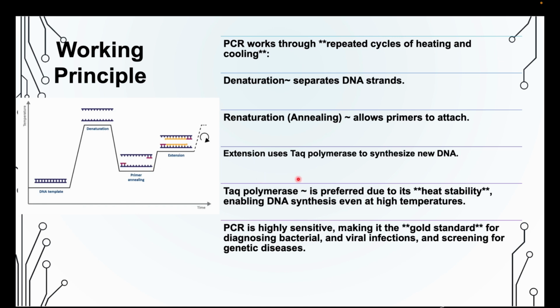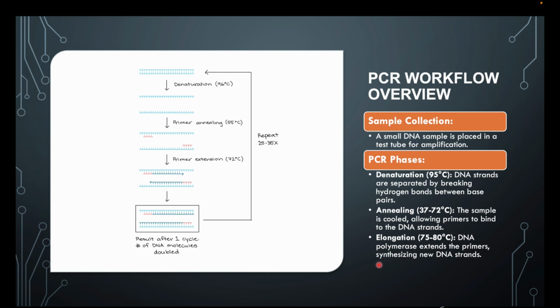So this enzyme should be heat stable. Then PCR is highly sensitive, making it the gold standard for diagnosing bacterial and viral infection and screening for genetic diseases.